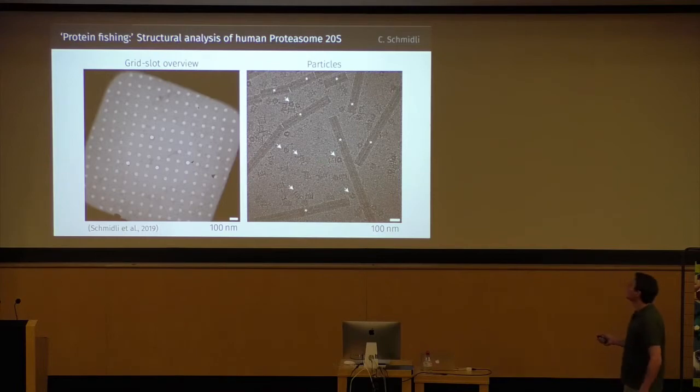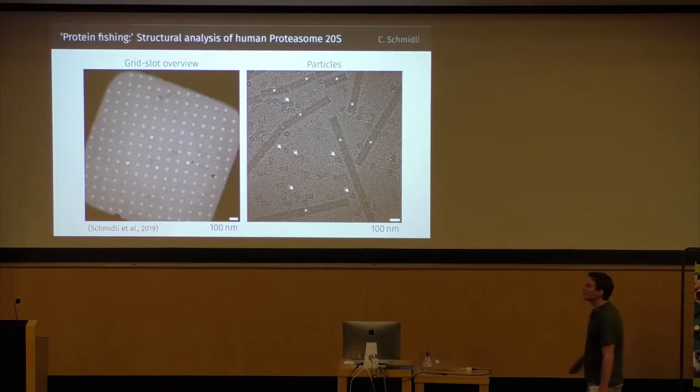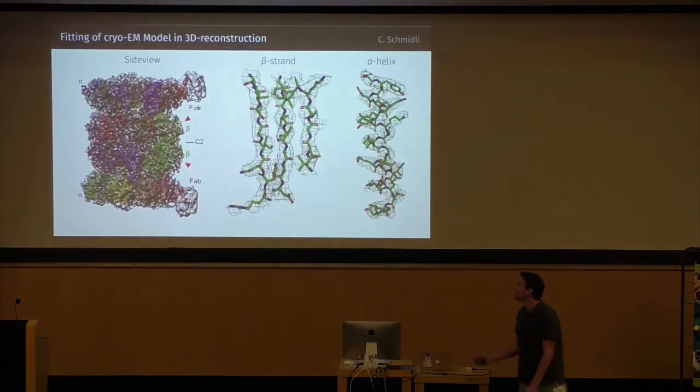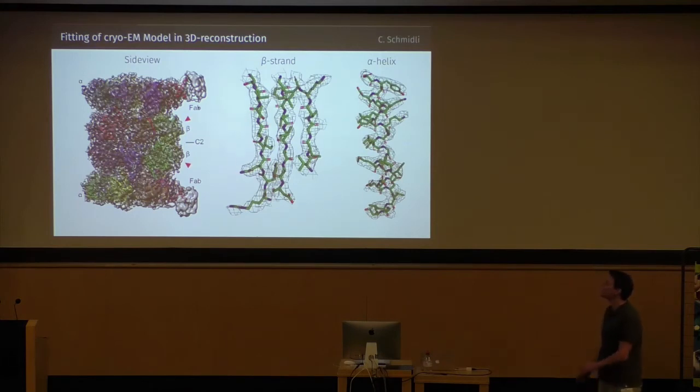You can see on one hand the proteasome he was fishing, and on the other hand you can also see TMV, which he was adding as a resolution control. By just using this 900 nanoliters of starting material in fishing, he was able to get the structure of the endogenous human 20S proteasome and reach a resolution of 3.5 angstrom. Maybe it's also worth mentioning that the human 20S proteasome only has C2 symmetry and not D7 as in many other species.